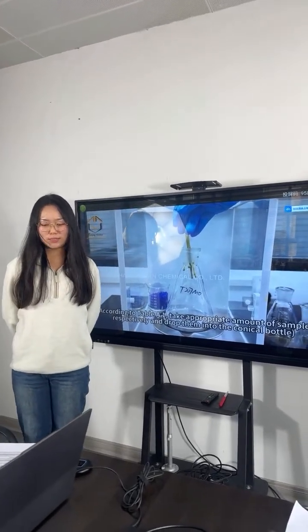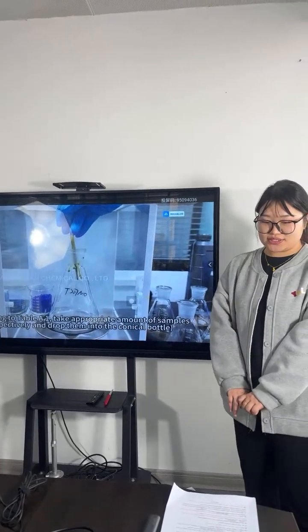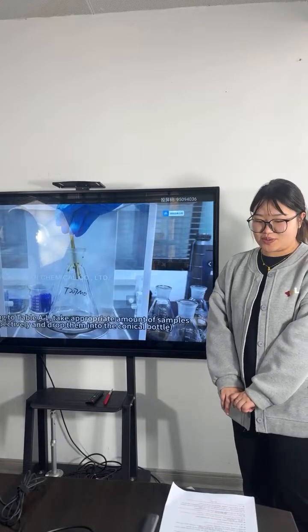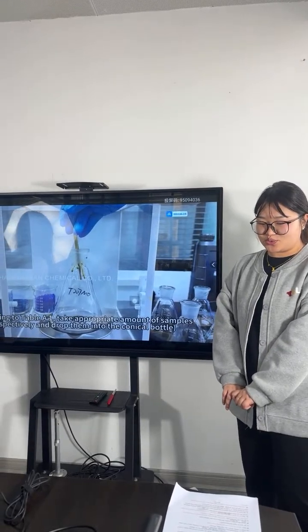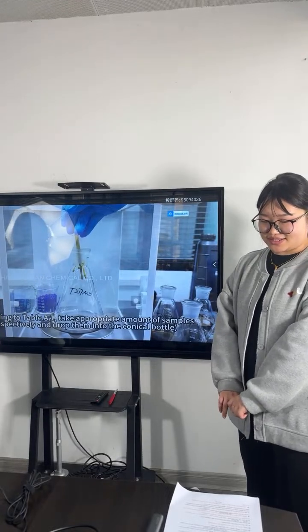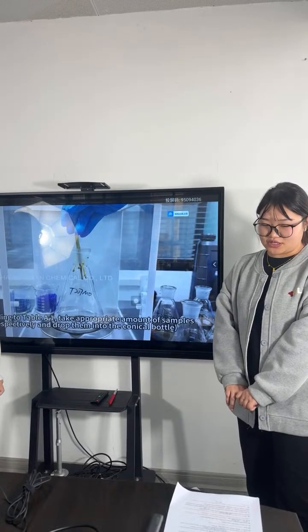Winnie, do you know what additive samples are used for the test? We use T217 mu 2, T21001 mu, T21002 mu, T20118, and 8556. We need to record the weight of each sample.